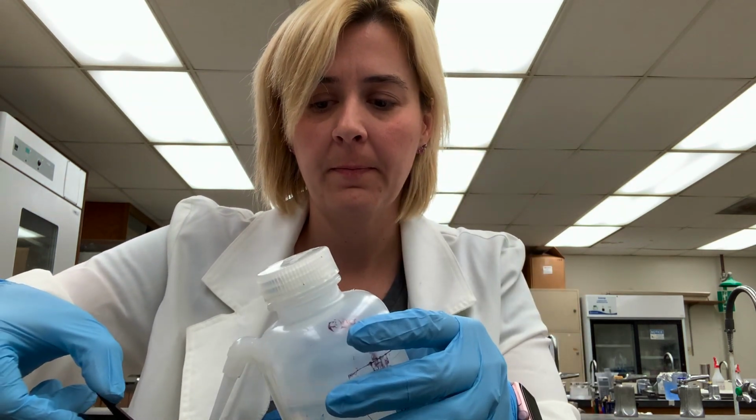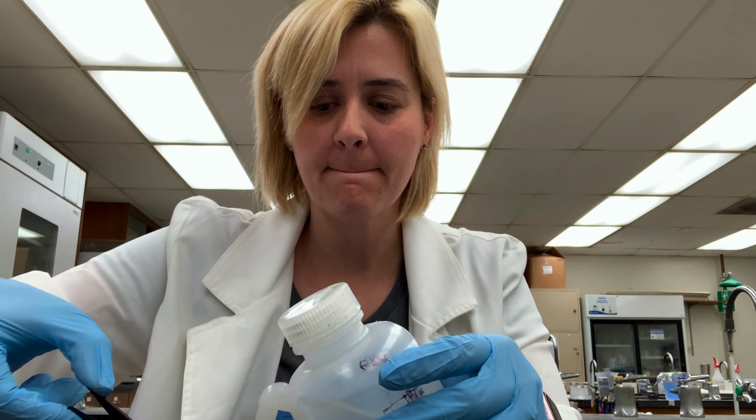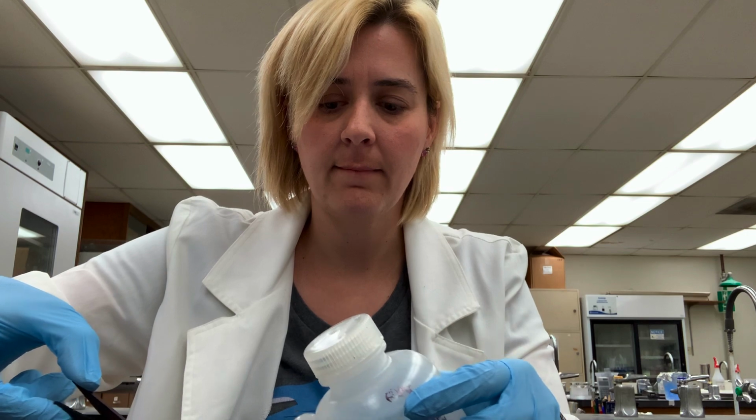Okay, so it's been a minute. Let's go ahead and remove our safranin using water. Okay, and then we'll put our slide to dry.